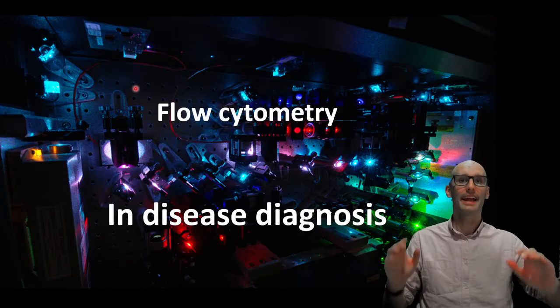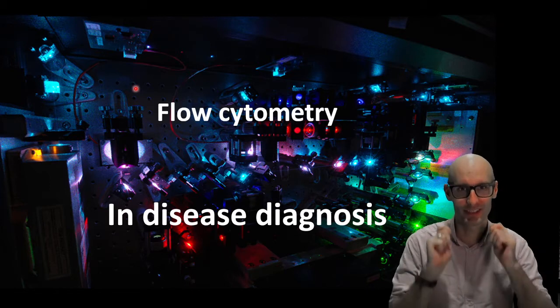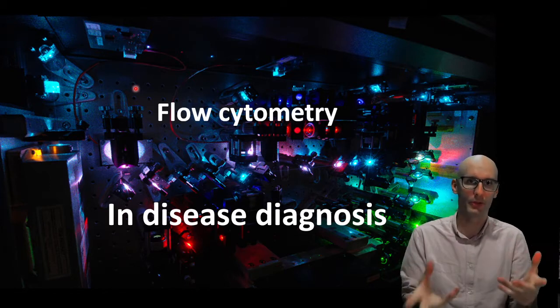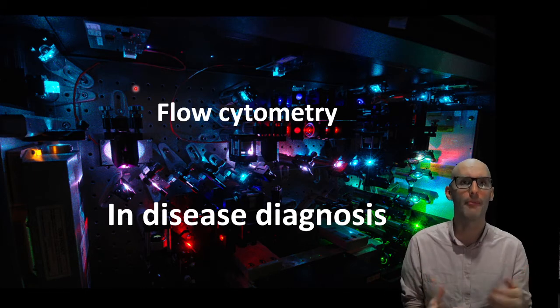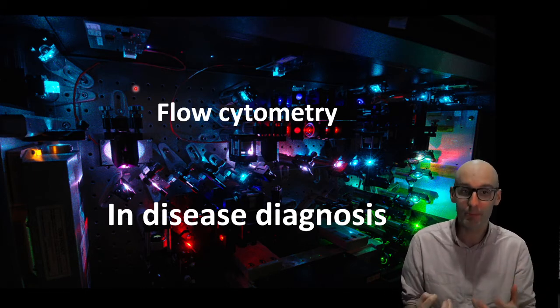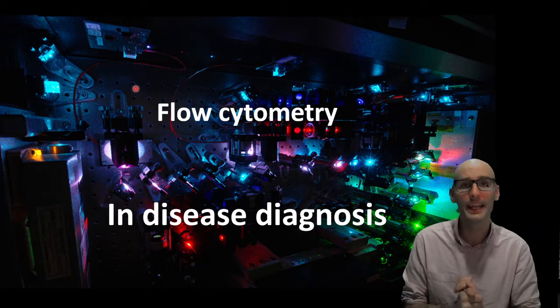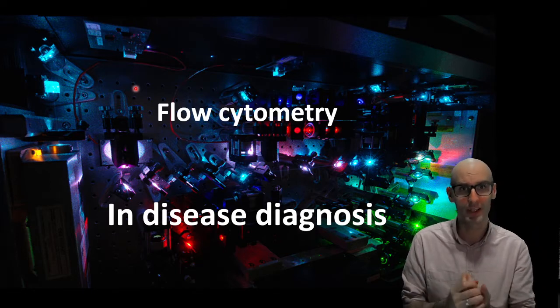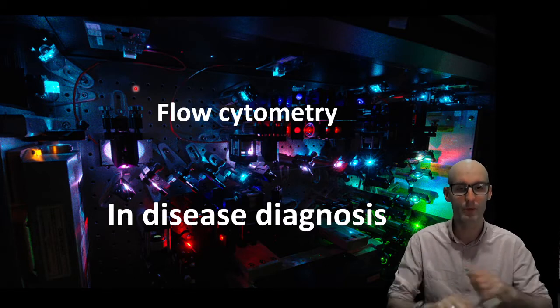Hey team, Jack here, and in a previous video I did a big deep dive into flow cytometry and how it's such an awesome technique for immune cell research. But today I wanted to take you through a clinical example just to show that it's really important for diagnosing disease progression, disease severity, and whether the treatment is working, using immune cell populations as an example.